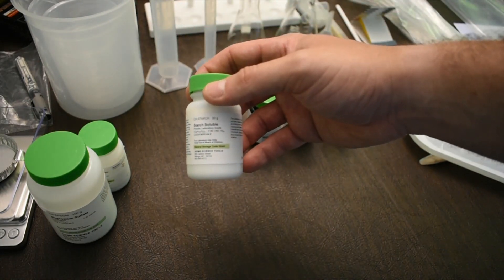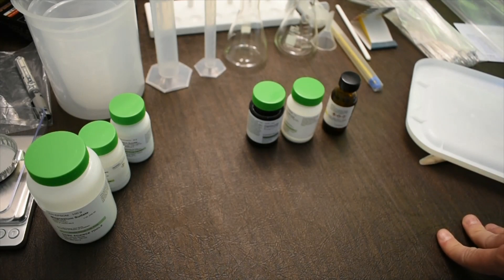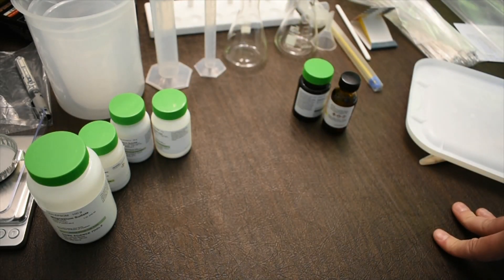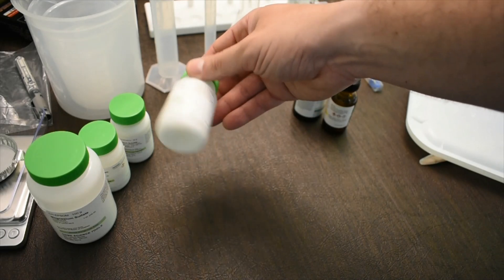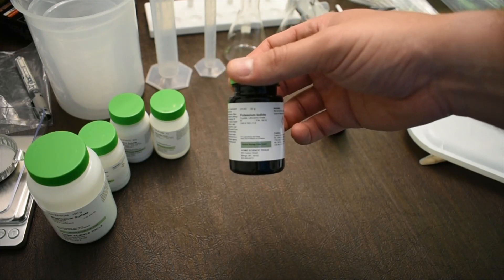The starch solution is a soluble starch, similar to laundry starch used to prevent wrinkles, but water-soluble for easier use. Ascorbic acid is the same thing as vitamin C found in orange juice, so no real hazards there. However, because it's a weak acid in powder form, it can be a bit of an eye irritant, so wear safety glasses.